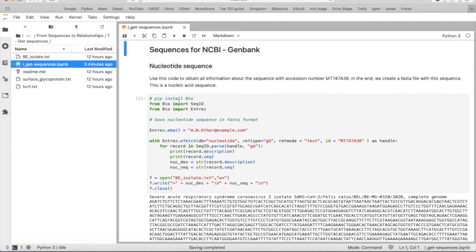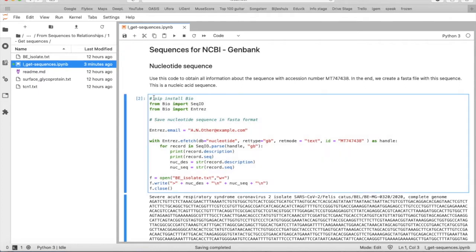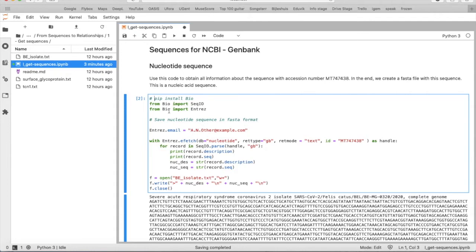Because maybe it's your first BioPython script, so first you need to install BioPython using this only line of code, and then you introduce SeqIO and Entrez from the BioPython package.